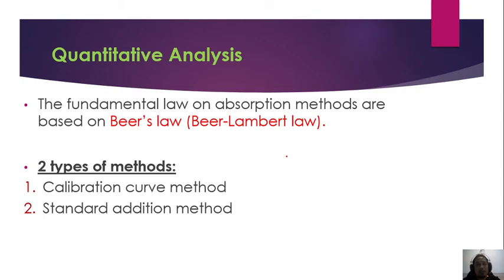In this video I will explain about quantitative analysis. The fundamental law on absorption method are based on Beer-Lambert law. There are two types of method, which is the calibration curve method and standard addition method.